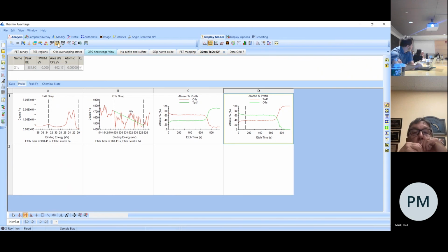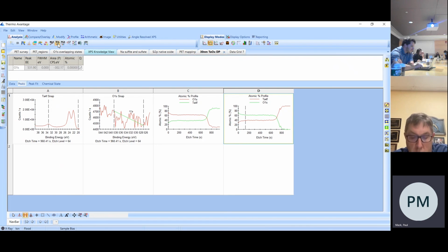I have an easy question, probably an easy question. Sure. Just when you do the fit, what is the difference between the two fitting options? Fit this level or fit all levels, basically. Yeah, fit this level or fit all levels.